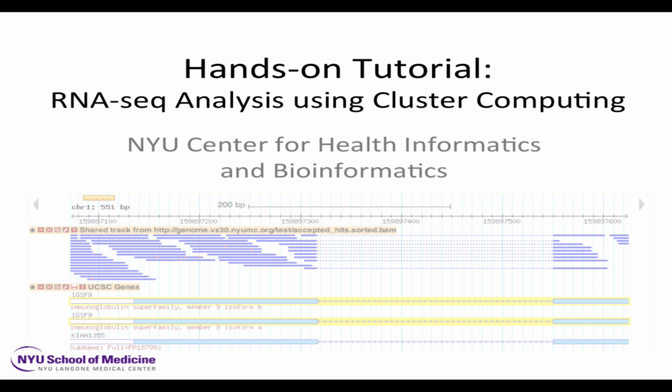Some people do that, but in general for bacterial RNA, we use a special ribosomal RNA depletion, which is actually called Epicentre Ribo-Zero. The reason it's used is because people can take samples that are mixed mammalian and bacteria, like a host and an infection, and then you can actually get reads from both the bacteria and the host at the same time. So that's actually quite a popular way of doing it.